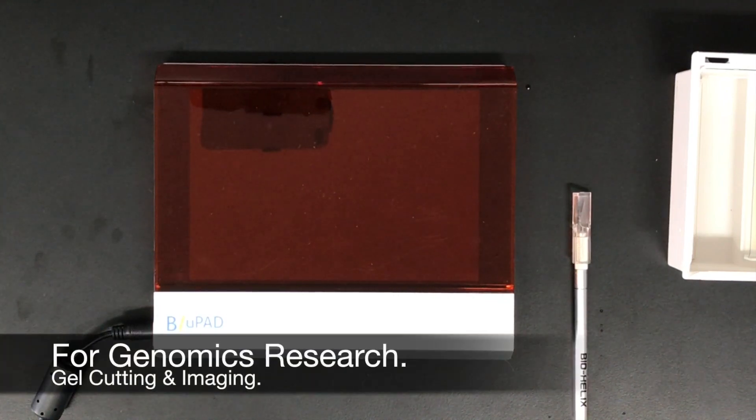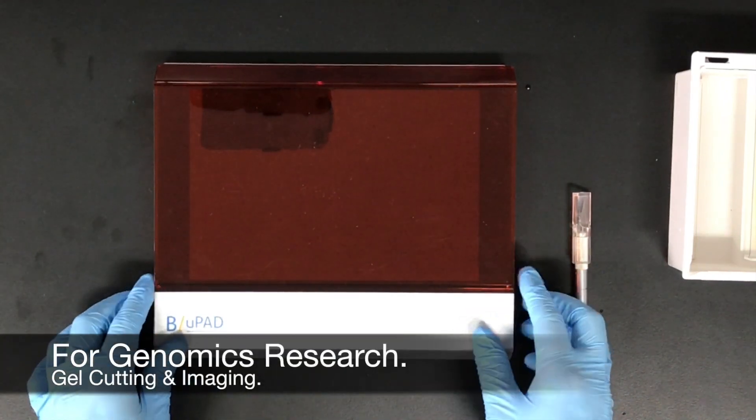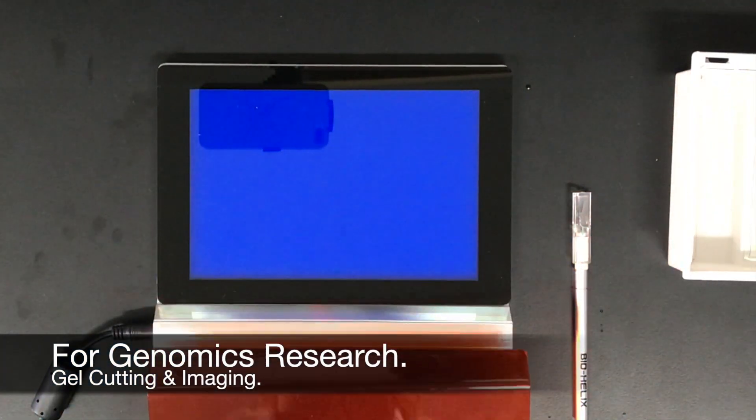When viewing the agarose gel, one needs to use the LED blue light mode with the tempered blue glass panel and amber filter.